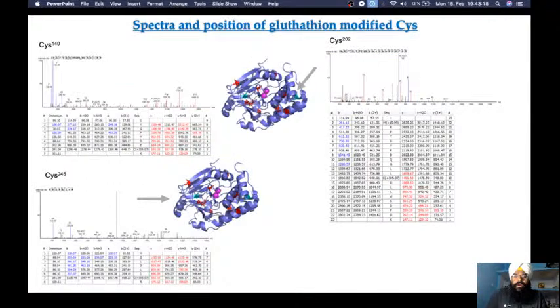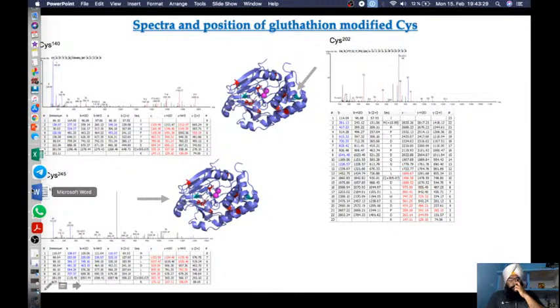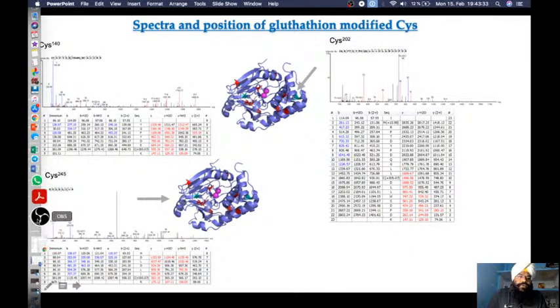So this is how you interpret the data. You can also find some glutathione-modified cysteine in the post-translational modifications, as per the results from the PEAKS software that we use for the ESI mass spectrometry.